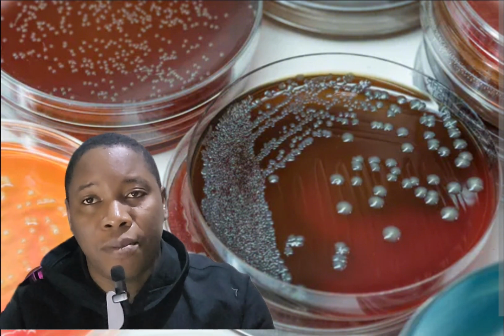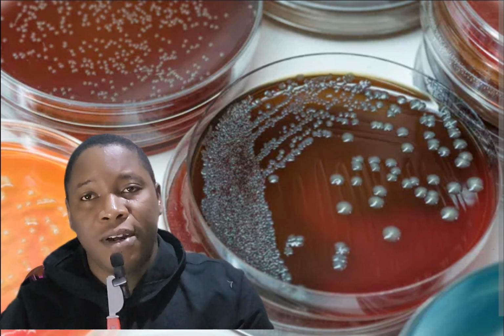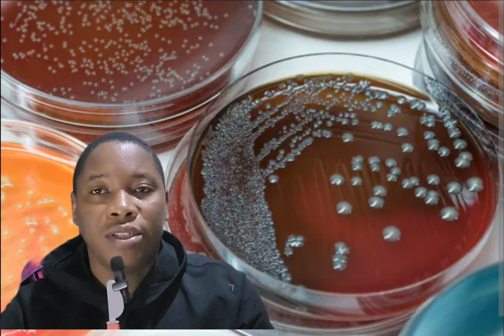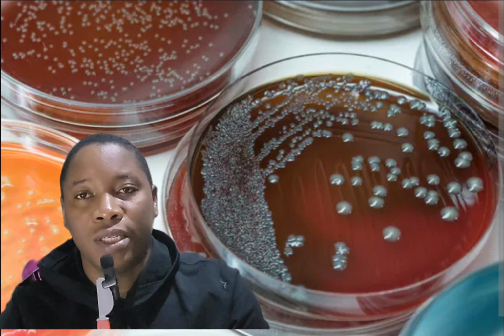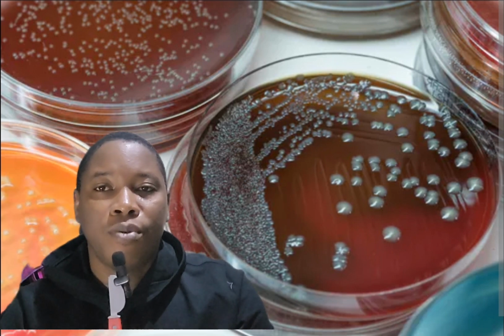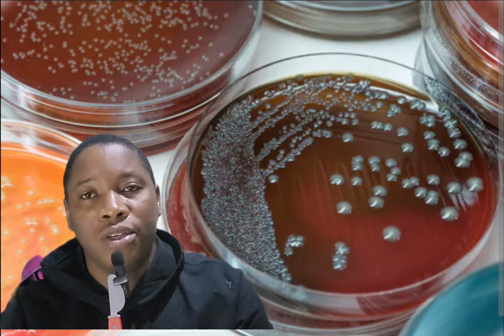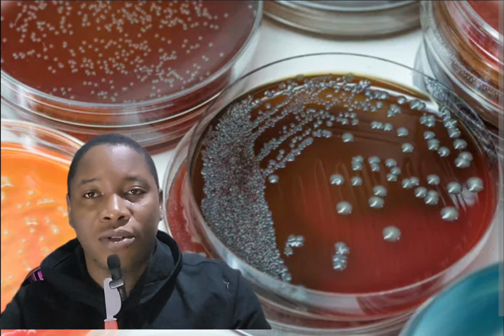Usually in the laboratory, we do a lot of culturing of bacteria. Different bacteria are cultured from different samples. So the idea is you have a sample, and you're wondering what kind of microorganisms, bacteria, are growing in this sample. So you have your initial preparation, you process the sample and prepare it. Different samples are processed in different ways, to be able to then culture microorganisms out of these samples.